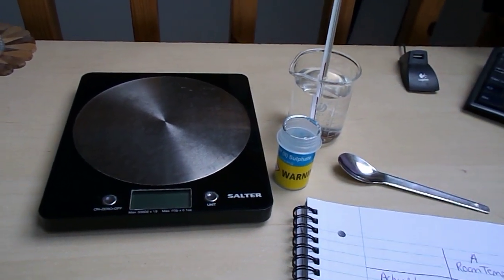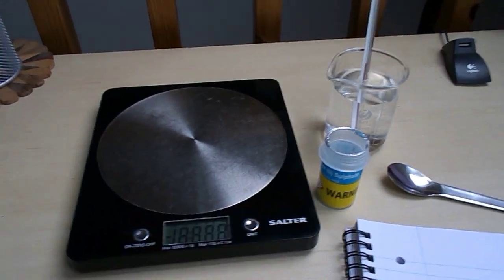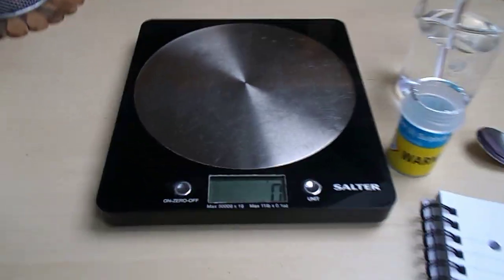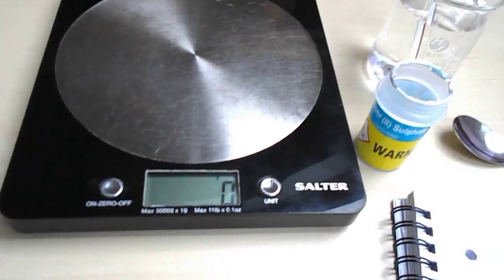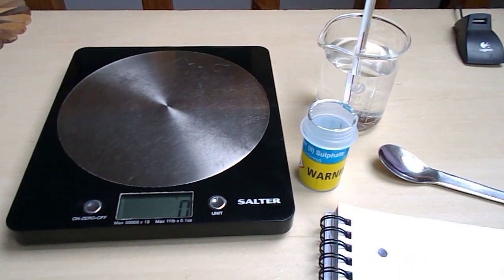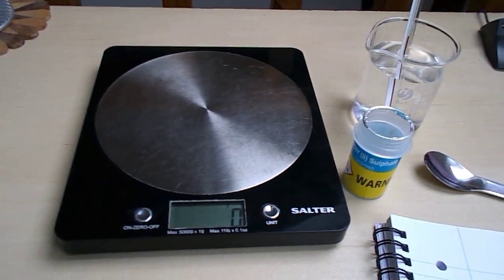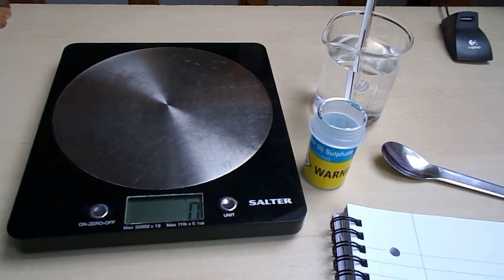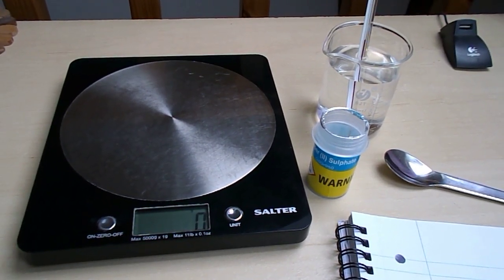It says the copper sulphate powder and beaker were going to be weighed. So I'm going to use my kitchen scales here. If you notice on my kitchen scales, we're just recording in whole grams here. Obviously in the lab we can record to 2 or even 4 decimal places. So again, not so accurate, but it will do for the purposes of showing you the idea. And then we've got some results that were recorded more accurately beforehand.